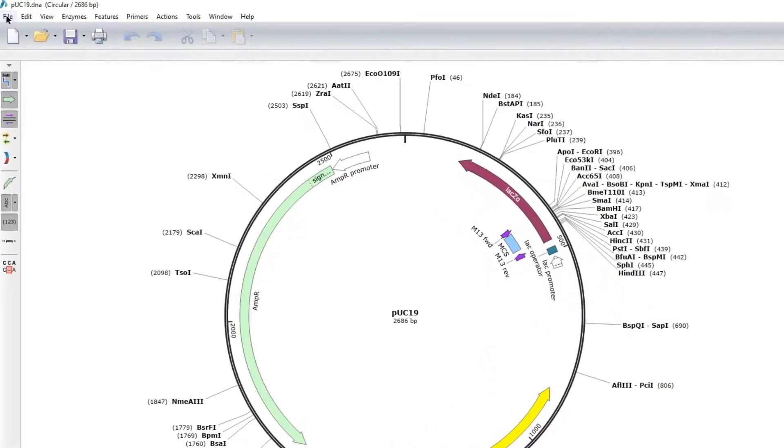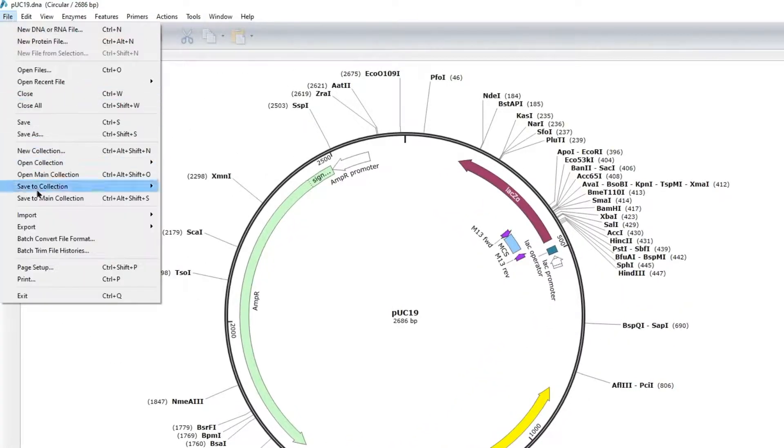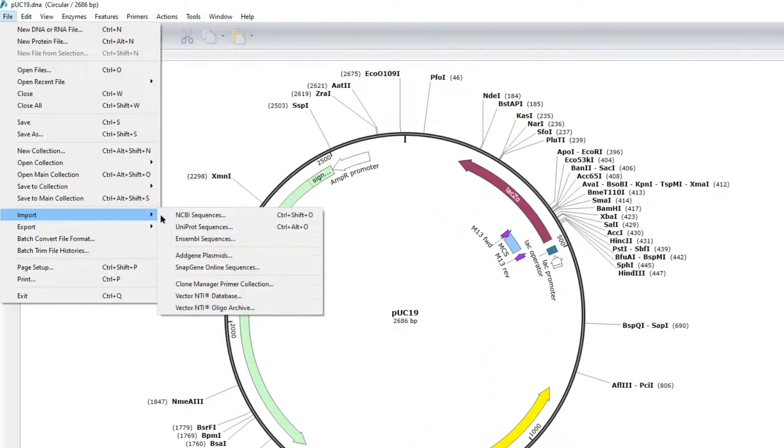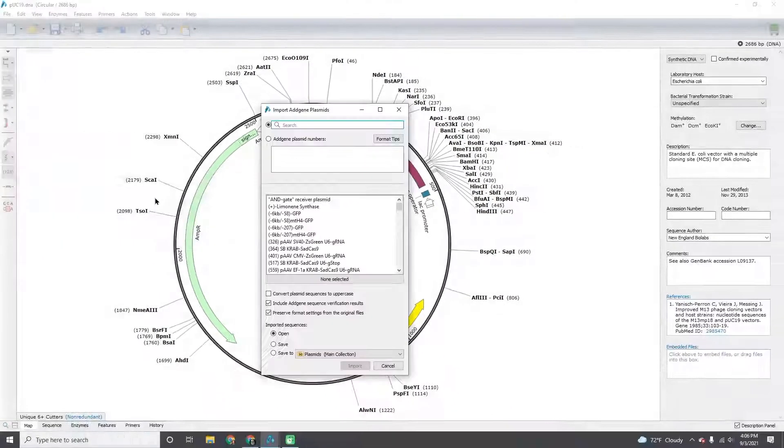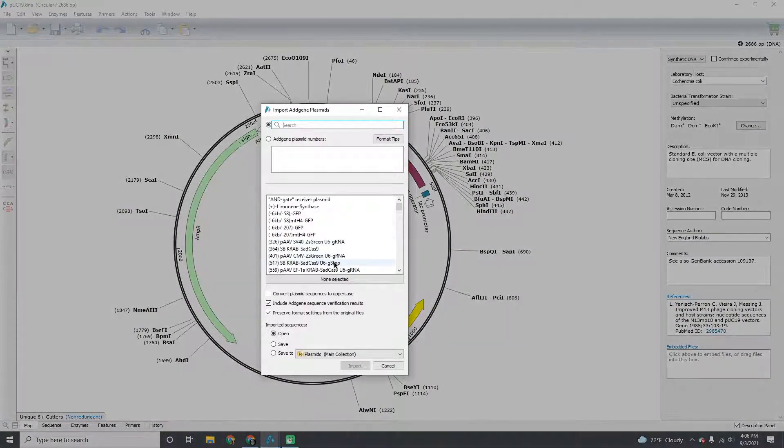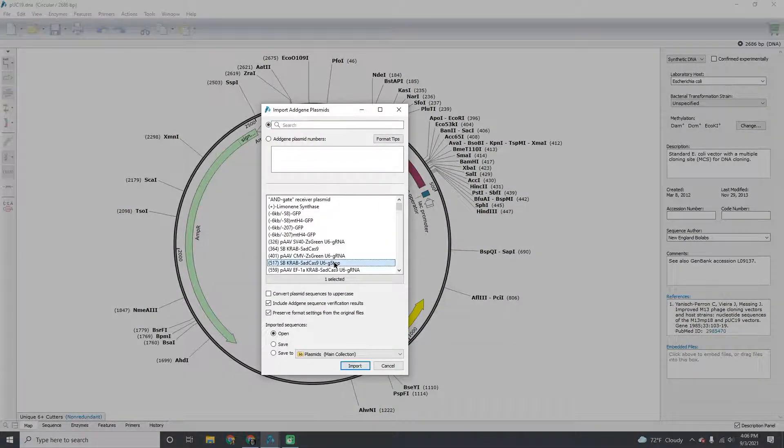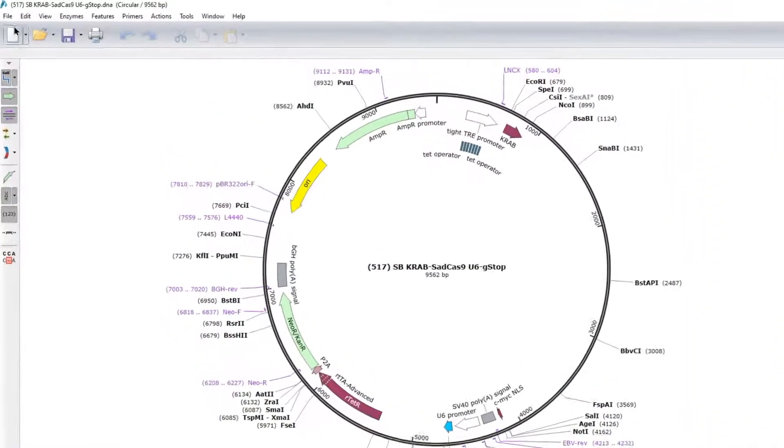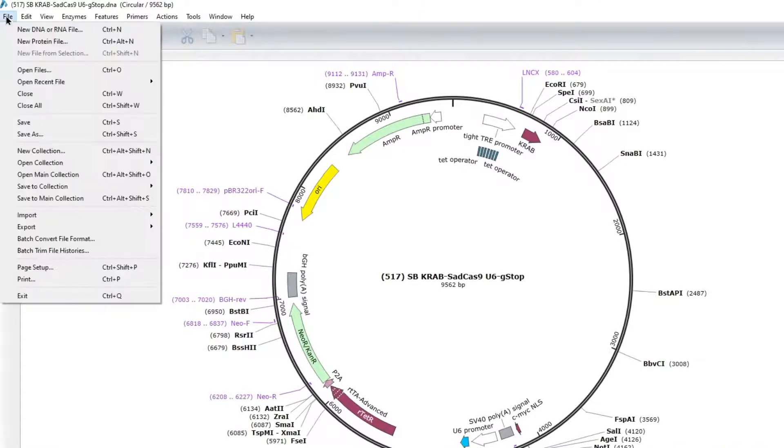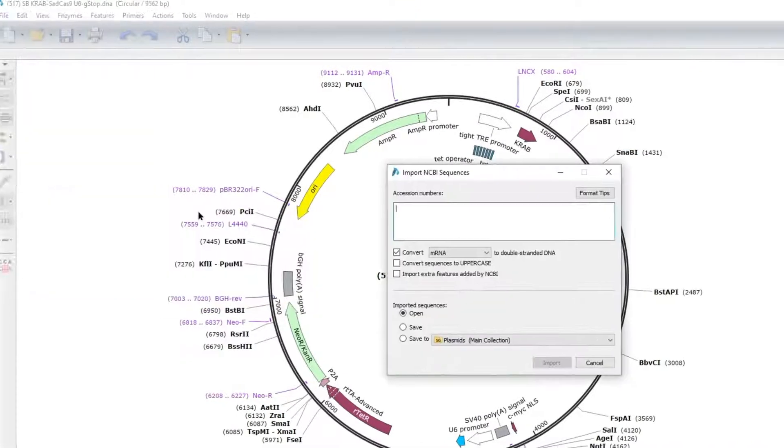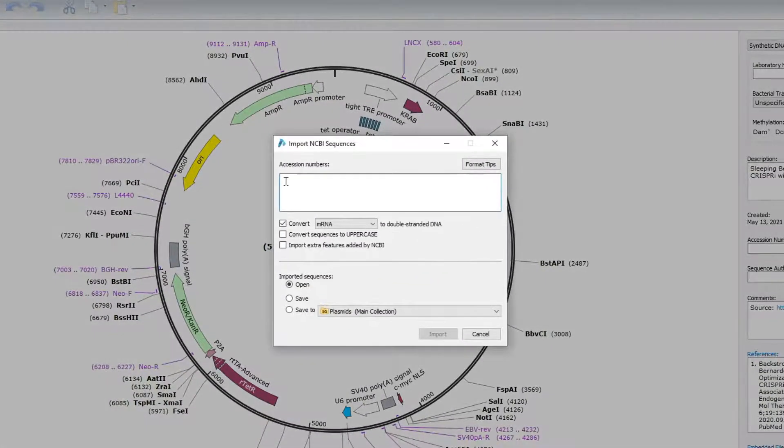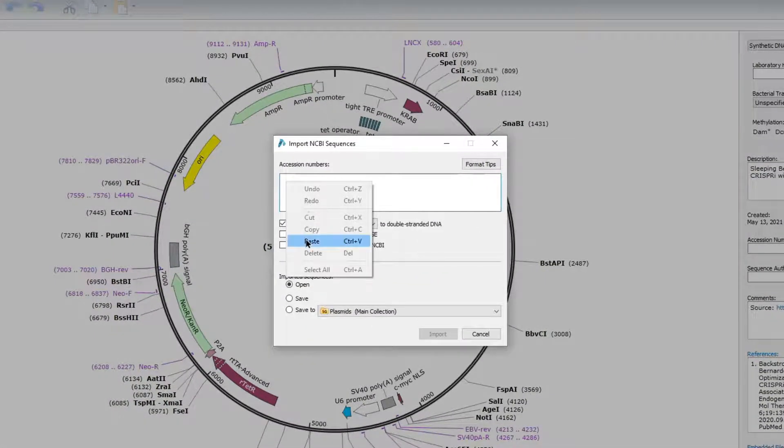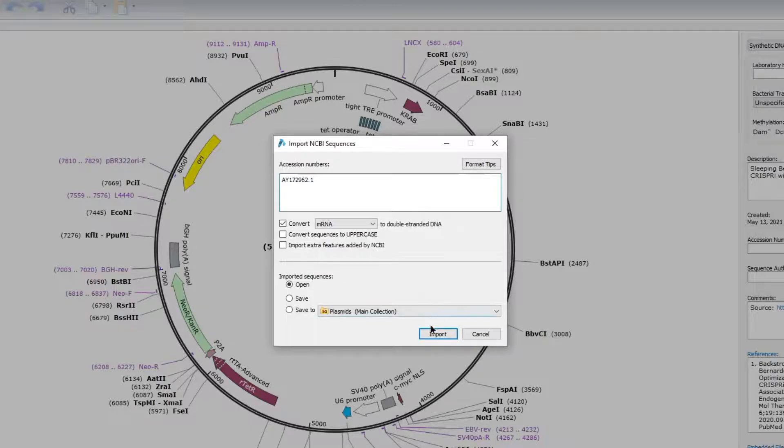You can also do these tasks from the main SnapGene interface, including selecting and importing AddGene plasmid sequences, or any published sequence from NCBI, UniProt, or Ensembl using the accession number.